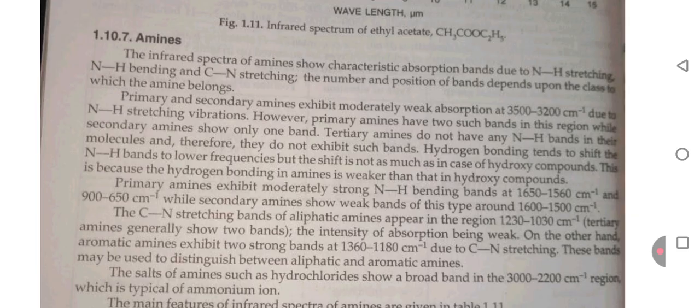Primary amines exhibit moderately strong NH bending bands at 1650 to 1560 cm⁻¹ and 900 to 650 cm⁻¹, while secondary amines show weak bands of this type around 1600 to 1500 cm⁻¹. The CN stretching band of aliphatic amines appears in the region 1230 to 1030 cm⁻¹. The intensity of absorption is weak.